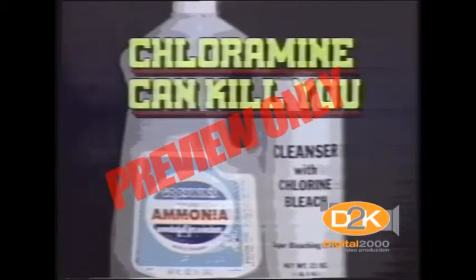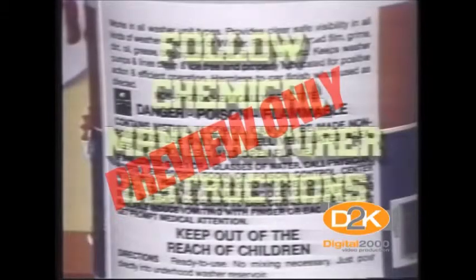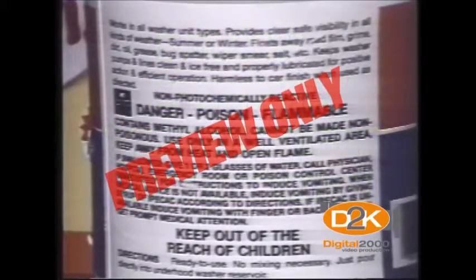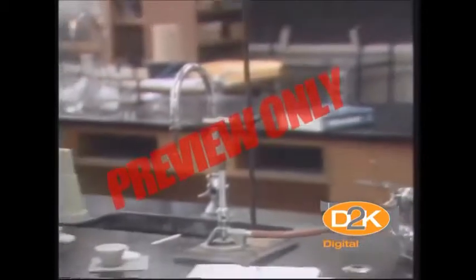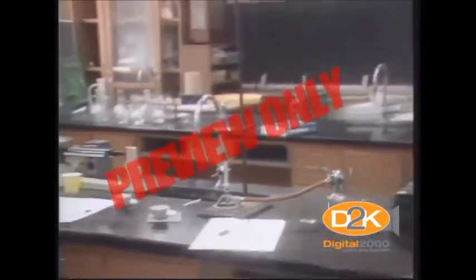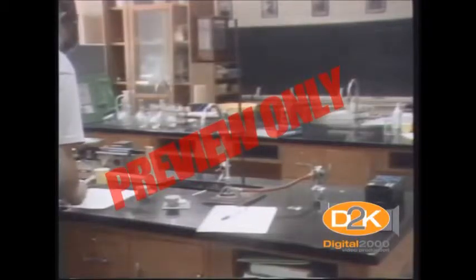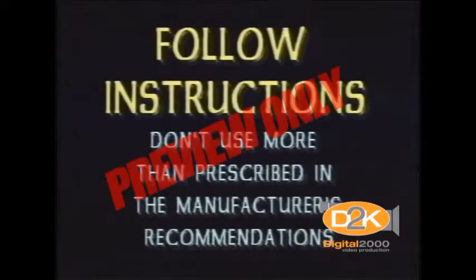Don't mix chemicals unless you have the training and knowledge. Always read and follow the chemical manufacturer's instructions. Another favorite is to disregard the prescribed amount of chemical to be used. If 1 teaspoon is supposed to work okay, then shouldn't 2 teaspoons be better? Not so. Chemical manufacturers have specific instructions on how much to use and when to use it for a purpose.